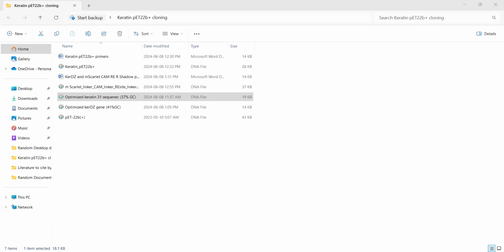So this PCR requires certain modifications, which is adding more magnesium ions, adding more DMSO very often, adding more nucleotides, and it's usually high fidelity polymerase, which is either Q5 or Thermo Fisher one. But it's doable, and we've been doing it in the past, so I'm confident we can do it again.